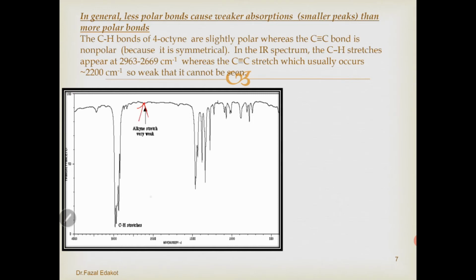It's very small. Whereas if you take CH, it is more polar than this, so you get a strong peak.